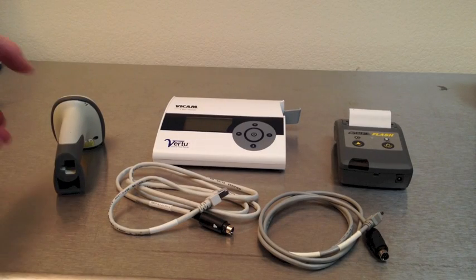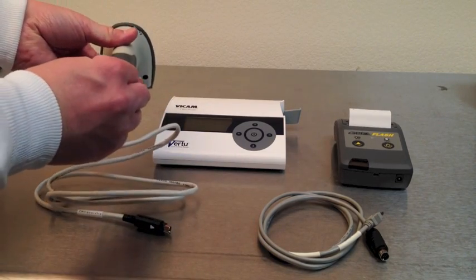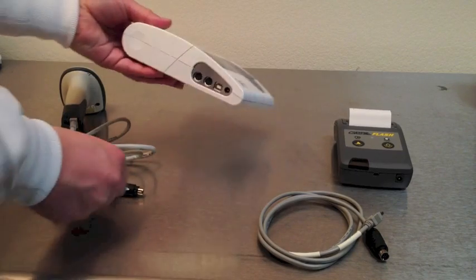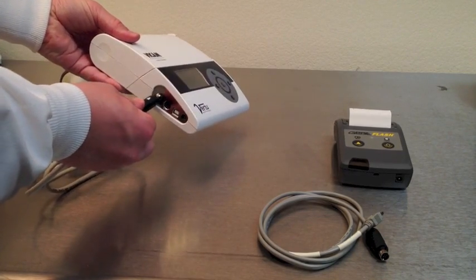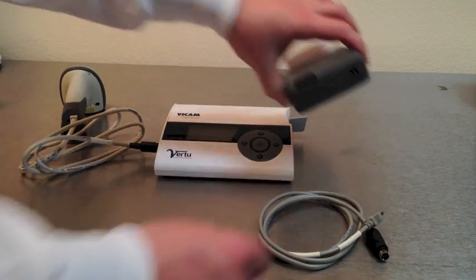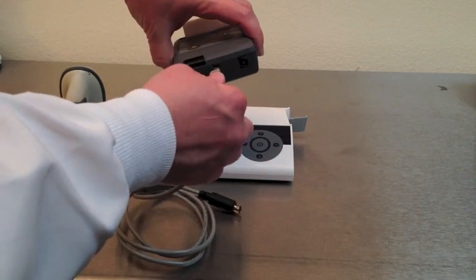The Vertu equipment package includes a barcode scanner used to choose the test you're selecting, as well as a printer to print results. Attach the wire to the bottom of the barcode scanner and then plug into one of the two ports on the side of the Vertu. Either one is fine; they are interchangeable.